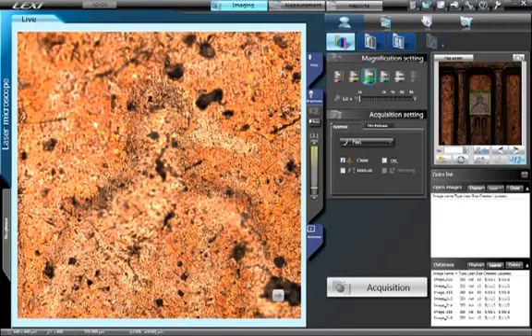The solution to this application is to acquire a series of adjacent confocal images to be stitched together, creating a single panoramic or mosaic image. This solution provides both the high level of optical resolution required as well as extending the field of view.